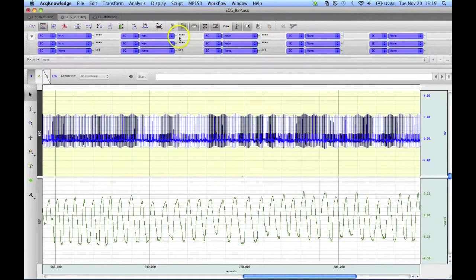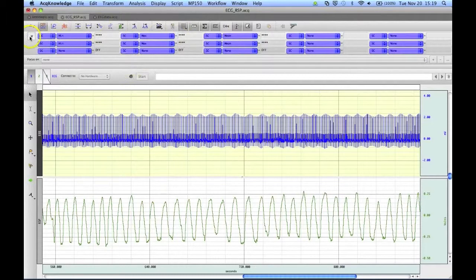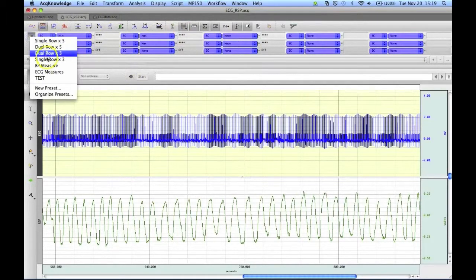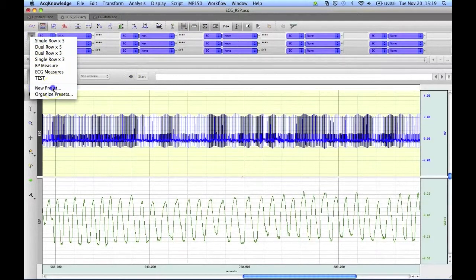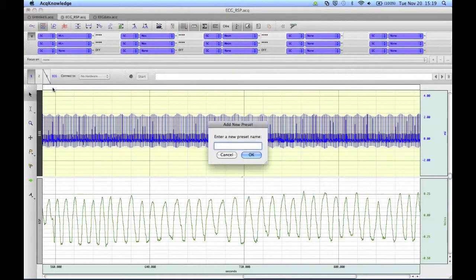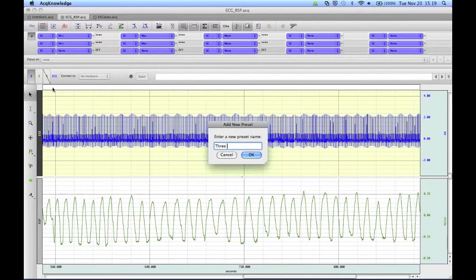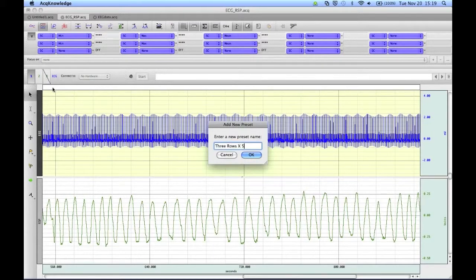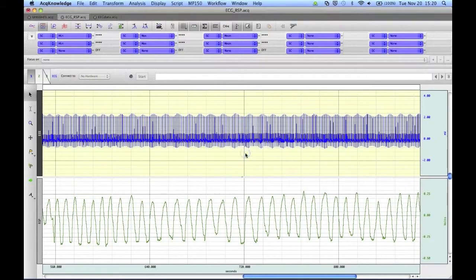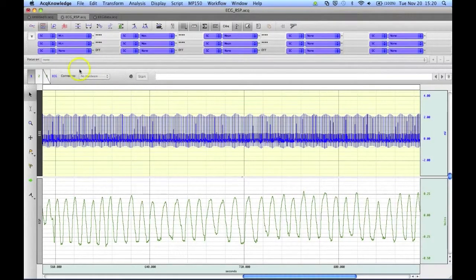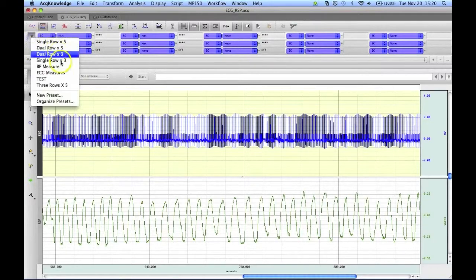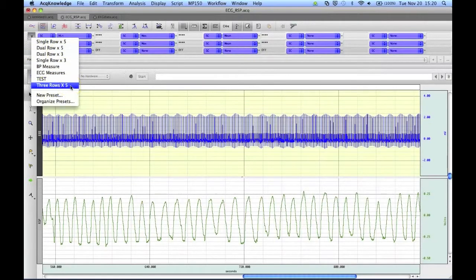And you'll see here's my new configuration. I can then scroll down and save this as a new preset, and I can call this 3 rows by 5, and click on OK. And we'll now see if I go back to that drop-down menu, the new preset of 3 rows of 5 is shown on the list.